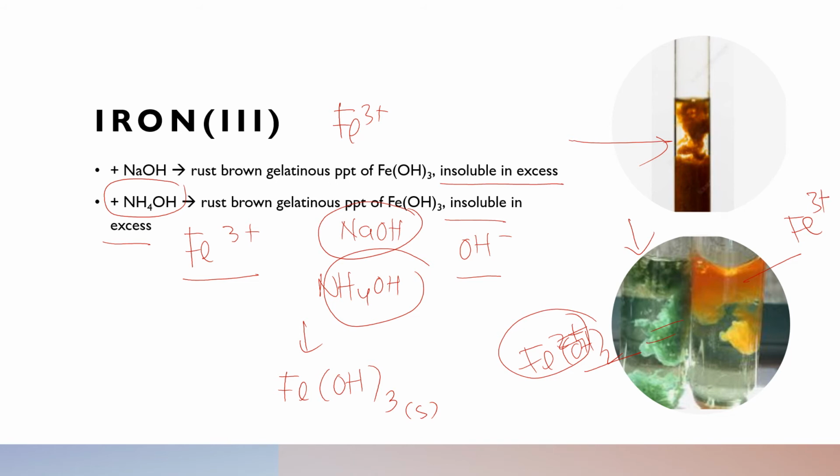After some time exposed to the air, the Fe(OH)2 will be oxidized into Fe(OH)3. So the color changes from green to orange or brown.